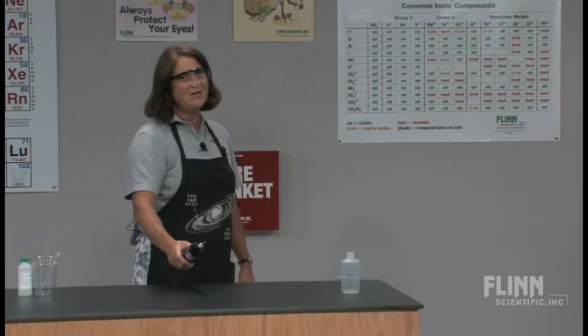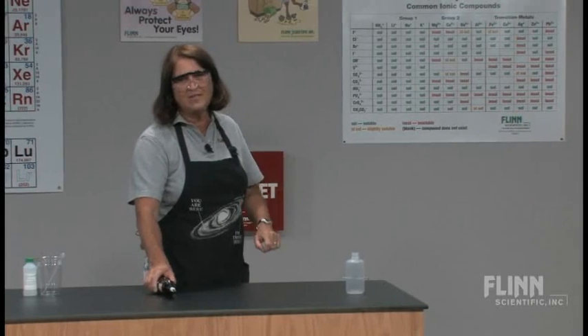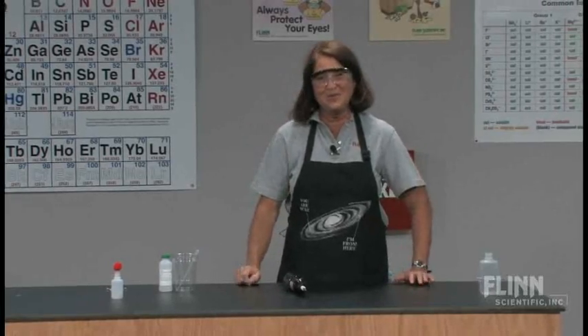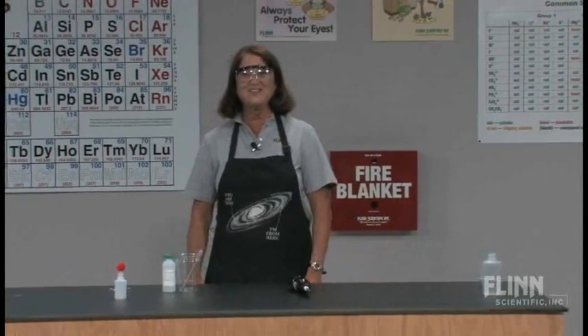I left a little too much alcohol in the flask — you could hear that thumping noise as the alcohol that was in there was burning away. You could also tell there was a difference in the sound between the mini me and the large ethanol explosion. Have a good time with it. Use it in your classroom when it fits in with the concepts you're trying to teach that day. Enjoy!